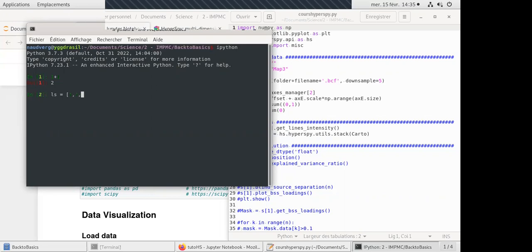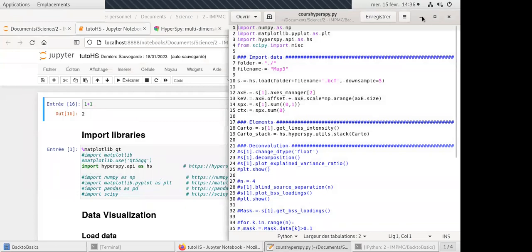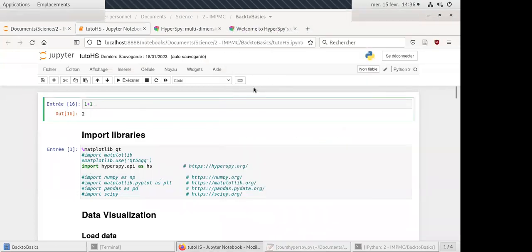You can create a list with several elements and work on it using basic tools. For example, if you want to access an element in the list you just created, you use a special function. Python is organized so that you download specific libraries to work with. I'll now use a more user-friendly environment called Jupyter.